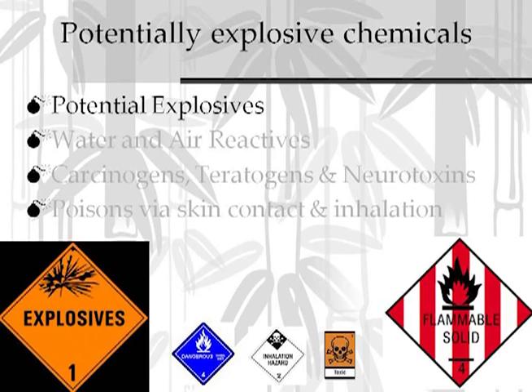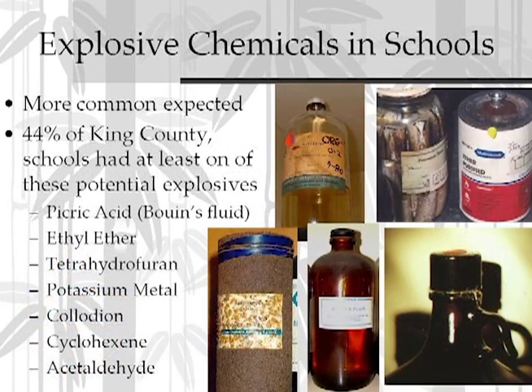So what are some of the explosive chemicals we can find in schools? Well, first off, you need to realize that these things are more common than you may expect. In King County, Washington, and the Seattle area, 44% of the high schools we visited had potentially explosive chemicals in them. These included things like picric acid, ethyl ether, tetrahydrofuran, elemental potassium, collodion, cyclohexene, acetaldehyde. Some are pretty obscure, some were a little more common. Let's go ahead and focus on some of those.